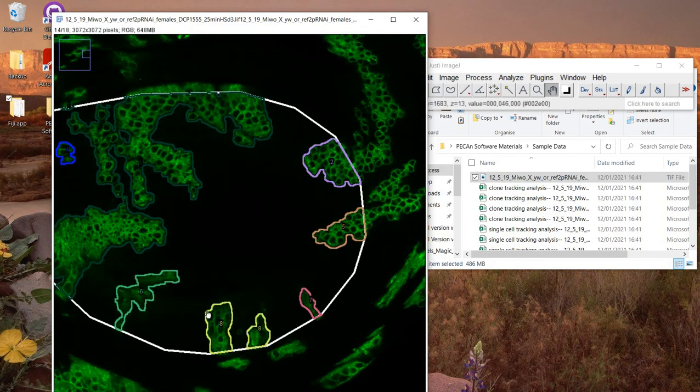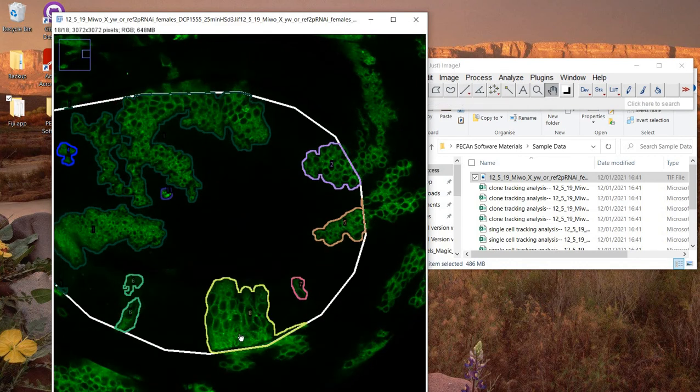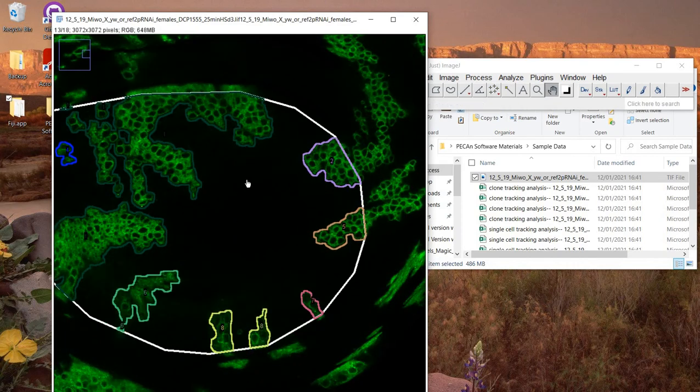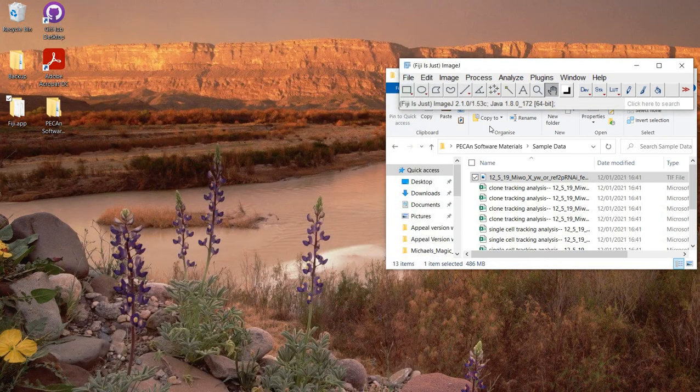And as you can see, at this particular z-plane, these two clones aren't touching each other, but they're labeled as the same thing, and that's because if we go a little bit deeper in, we see that they touch later. So we do account for merging and fusion events. And so this is going to produce all the data that is provided in the sample data space.